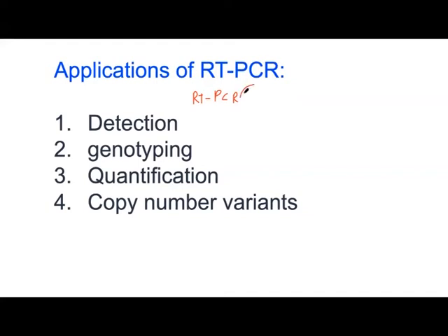And then I discussed that we use 2 types of fluorescence molecule. We use SYBR Green, which does not fluoresce. It only fluoresces when a double strand is formed. Or you can use different fluorescence, but you need to have a quencher with that. So this was basically an introduction about what real-time PCR is, for people who don't know what PCR and real-time PCR are. And now I'm going to move on to different applications and analysis.